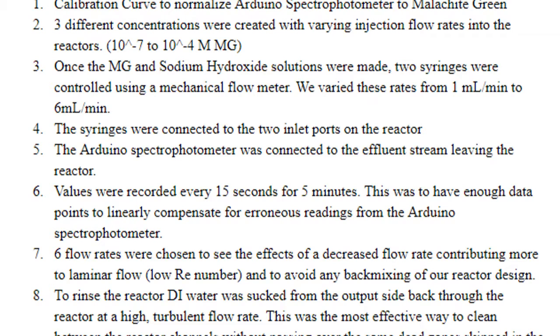Best practice procedures followed by Group 3 were to first find a calibration curve to normalize the Arduino spectrophotometer to the malachite green. 3 different concentrations were created with varying injection flow rates into the reactors, 10 to the -7 to 10 to the -4 molarity malachite green.